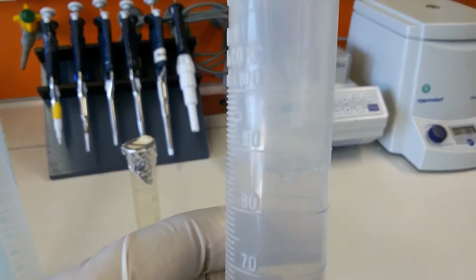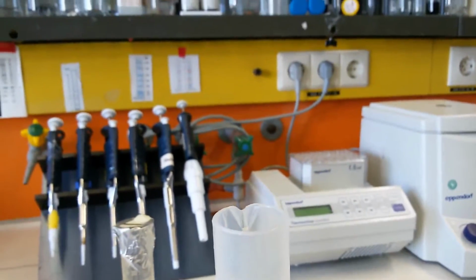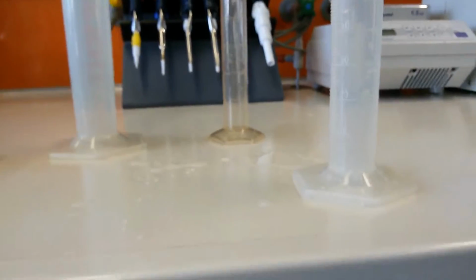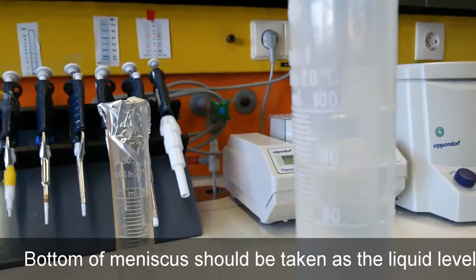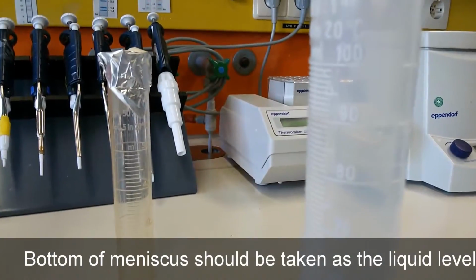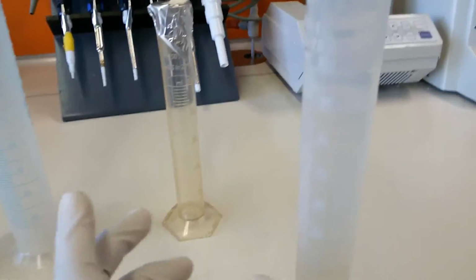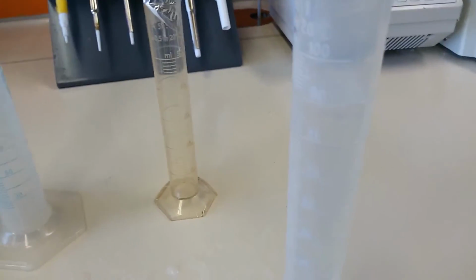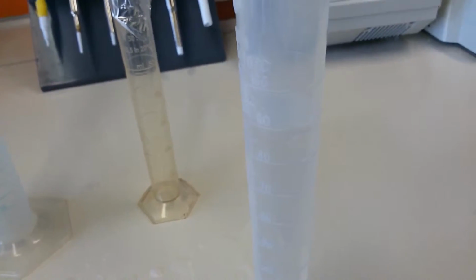So this is 80, here is 90, but we only get the right reading when you put it on a plane. So now we put it on our bench, and then we can see. This is 90 here, and it is filled till here. If you shake it a little bit, you can see it. That's how you measure, and then you add it wherever you want to add. We will tell you about this in our buffer exercise where we use the measuring cylinder. Okay, cool.